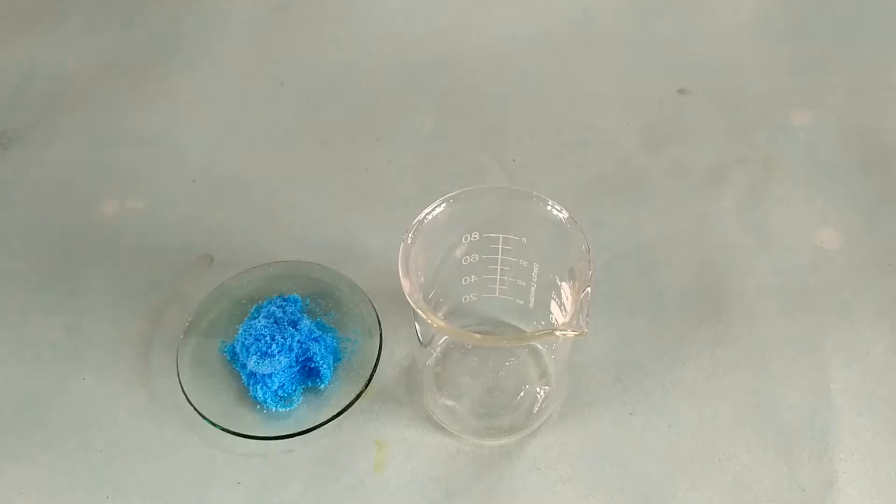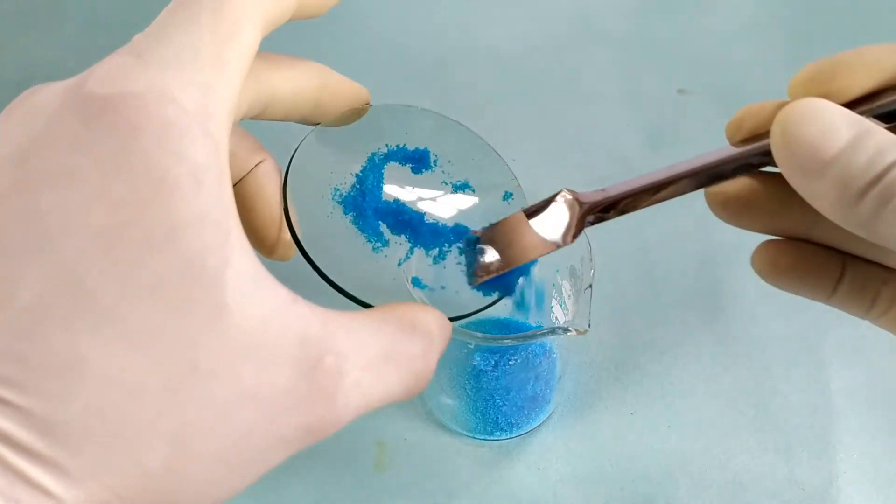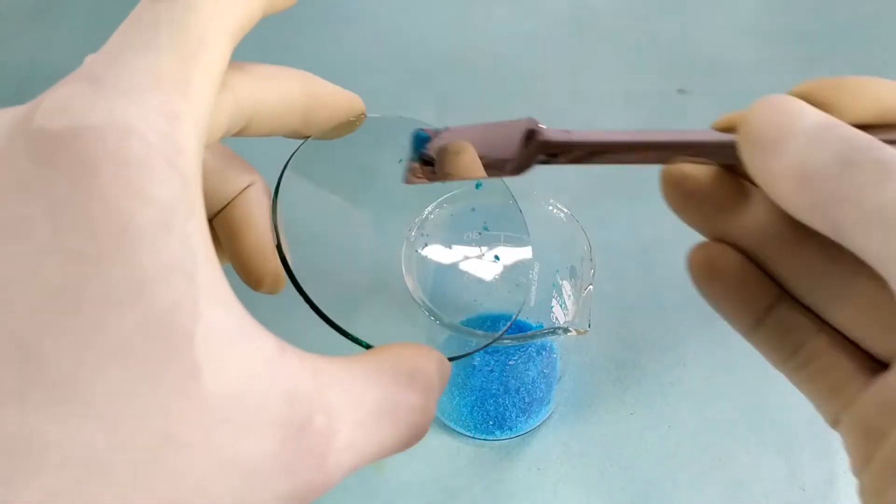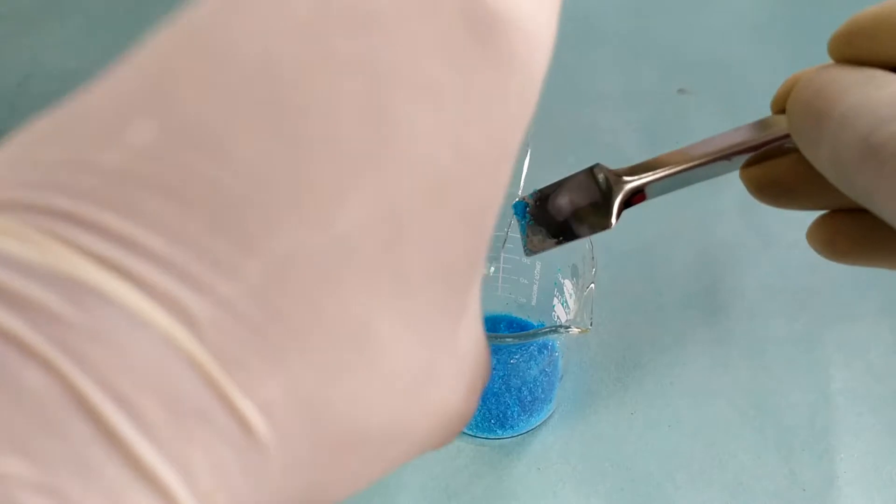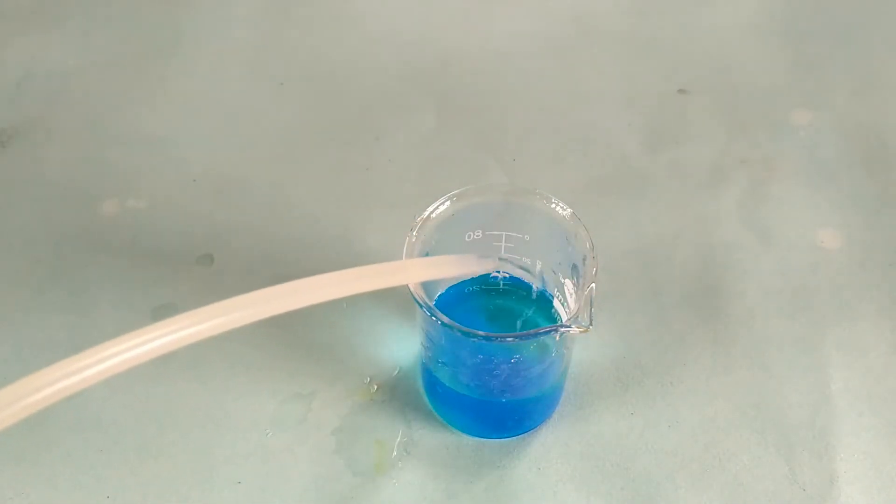To prepare Fehling's reagent-A, weigh 7 grams of copper sulfate pentahydrate using an analytical weighing scale. Transfer the salt into a beaker and rinse the spatula using a small amount of distilled water.